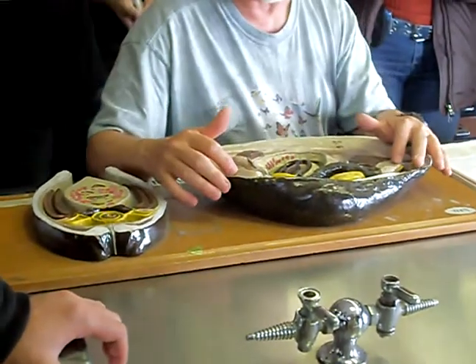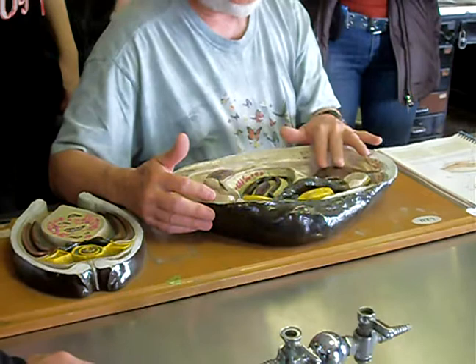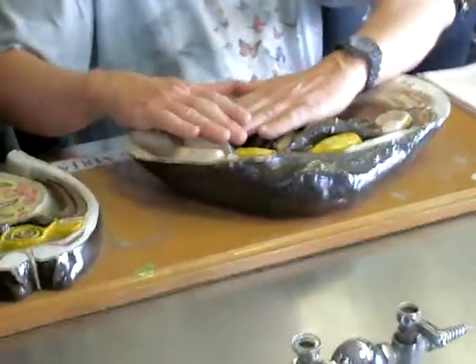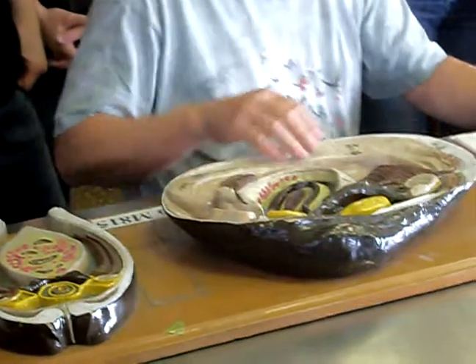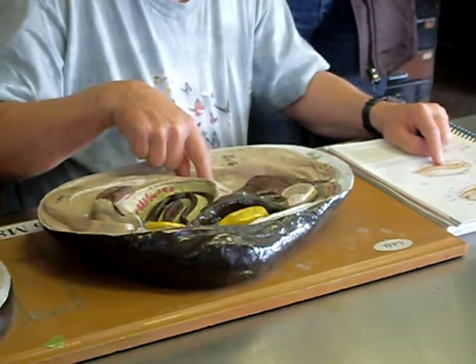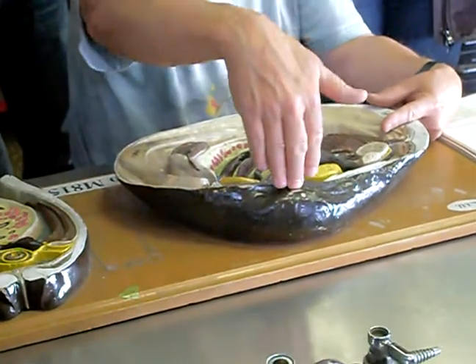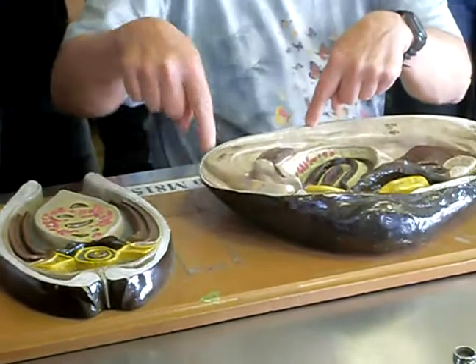So you have your anterior and your posterior adductor muscle. These organisms are filter feeders, and these are the gills — they've cut the gills away. These brown things here went the full length, but they removed part of the gills to show the internal anatomy. These gills have microscopic holes in them, and they're covered in cilia. This is dorsal where the shell is attached at the top, and where it opens at the bottom is ventral. So: dorsal, ventral, anterior, posterior.